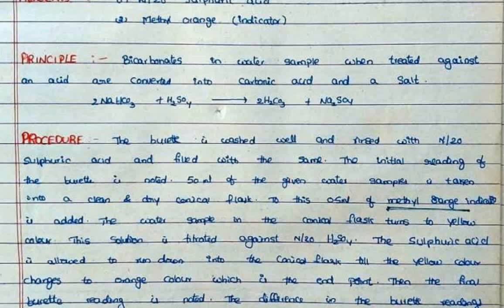This solution is titrated against N/20 sulfuric acid.